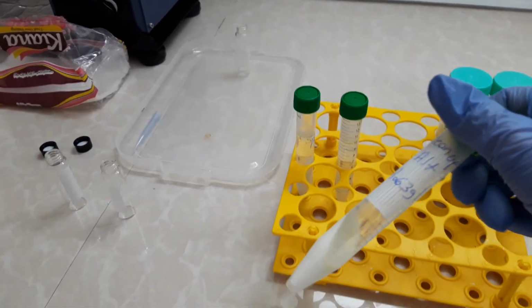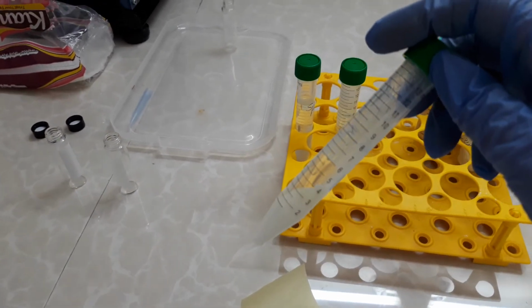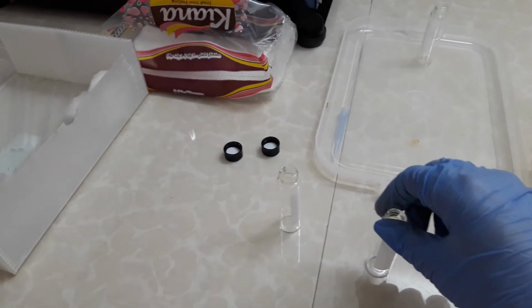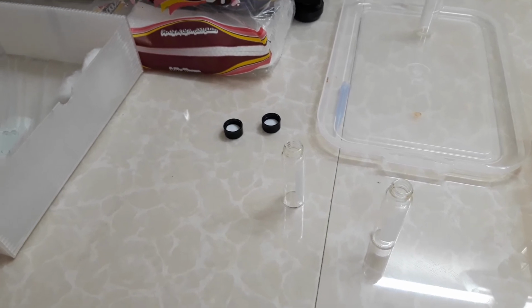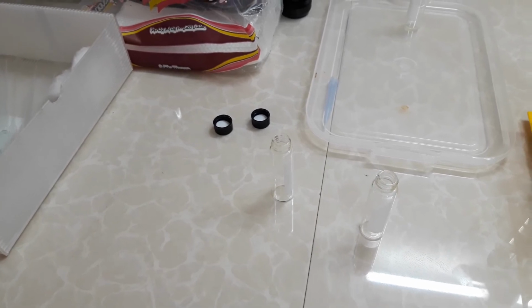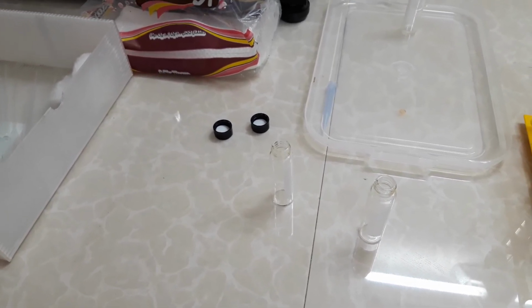Okay, after centrifuging the cleanup sample, in the final step, we transfer 5 milliliters of the solvent into this kind of vial. Then we put this vial in the hot block at a temperature of 30 to 35 degrees Celsius. After concentrating all of the solvent, we add 500 microliters of acetonitrile, and then this sample is ready to inject into the GC-MS instrument.